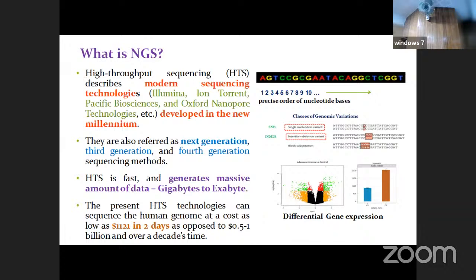So basically, the next analysis we can perform is differential gene expression analysis. We can take a set of diseased individuals and a set of normal individuals and compare the differences in gene expression level. We can correlate those dysregulated genes with the disease process. We will discuss that in detail in future slides. Here is an example for differential gene expression analysis. In the whole genome, out of 30,000 genes, you can see a few genes in green color. They are either upregulated or downregulated.